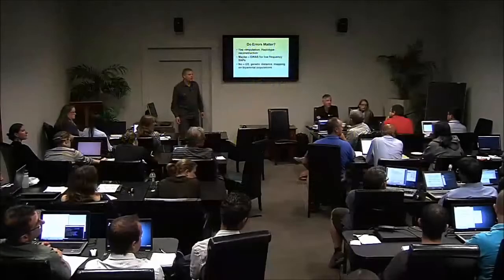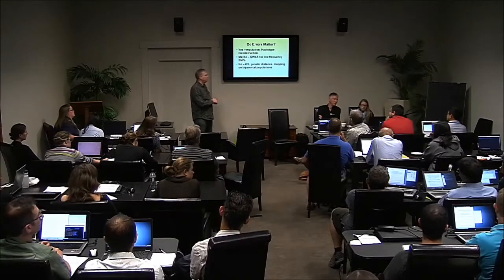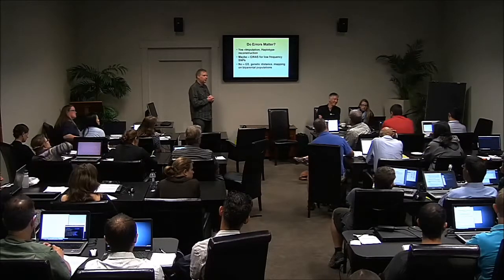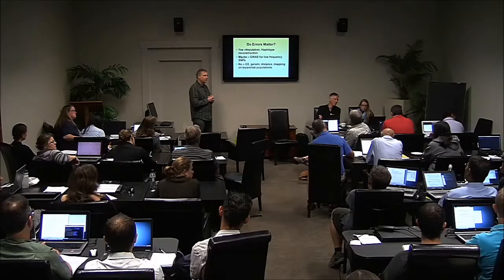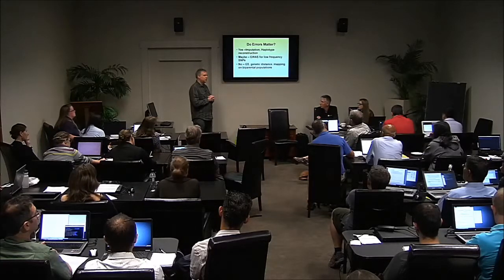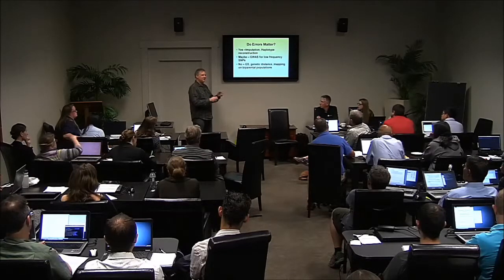I'm wondering about the fact that errors matter for haplotype reconstruction, and a question I wanted to ask in the Q&A before was whether the SNP calling pipeline can haplotype SNPs together, when you've got more than one SNP in one read, 64 base pair, so you can call a haplotype instead of a single SNP. Yes, you could. And actually the first GBS pipeline worked at the tag haplotype level, and then we switched to SNPs.